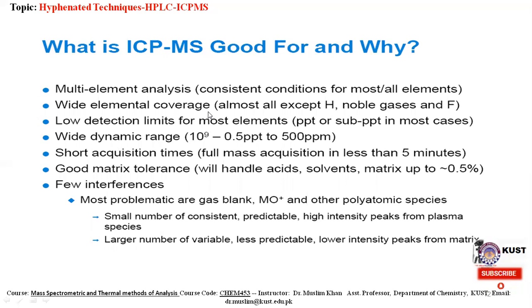Inductively coupled plasma mass spectrometry offers extremely low detection limits in the sub-parts-per-trillion (ppt) range.